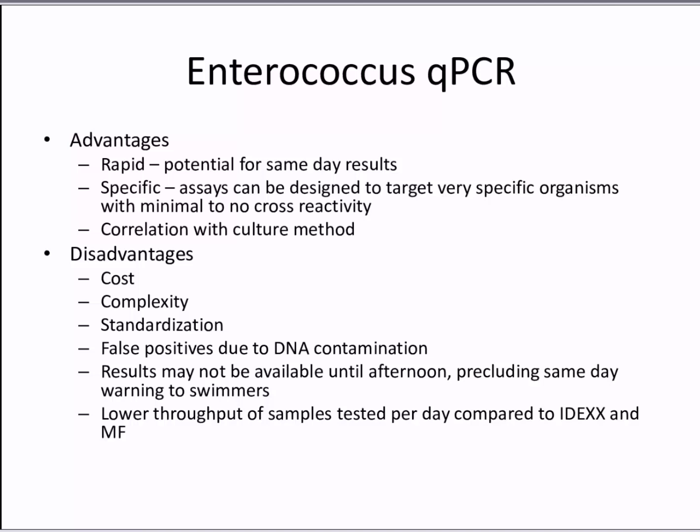The assays are specific, so your assays can be designed to target very specific organisms with minimal to no cross-reactivity. And the nice thing about these assays is when the technology advances and even more specific methods come out, it's not that difficult to adapt to the new version.